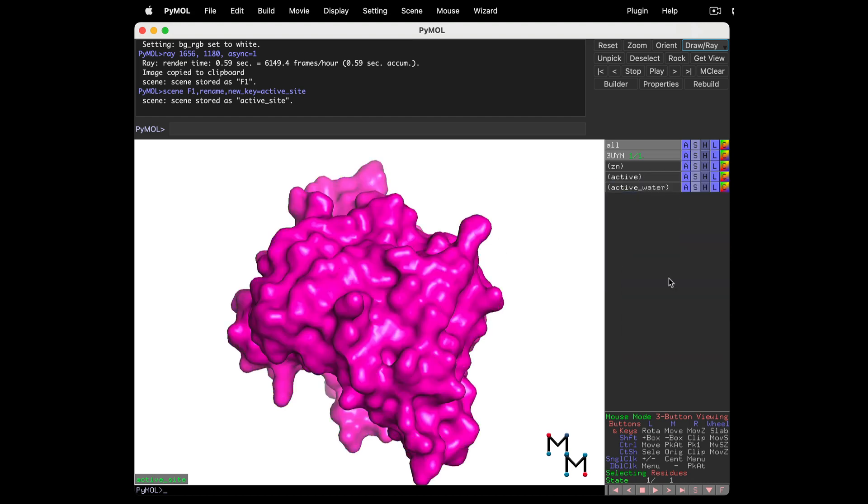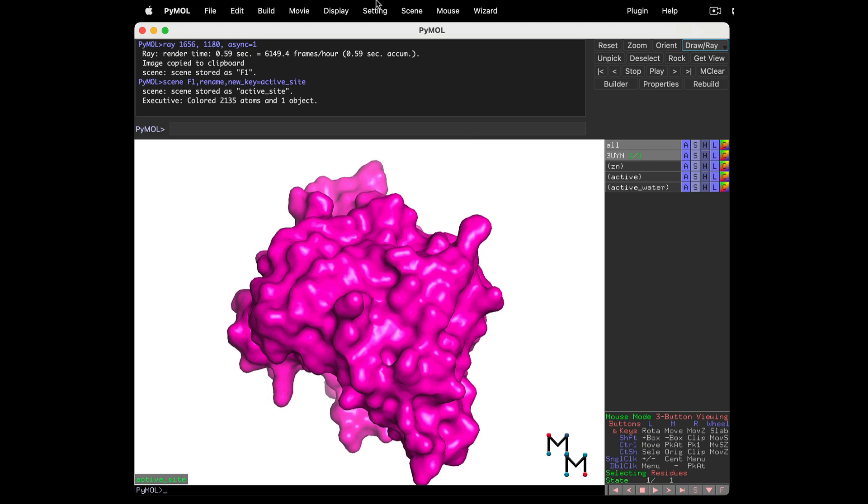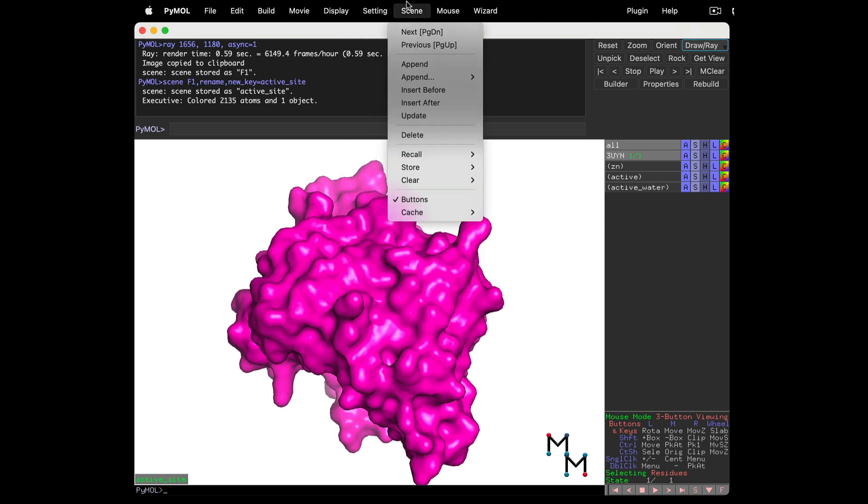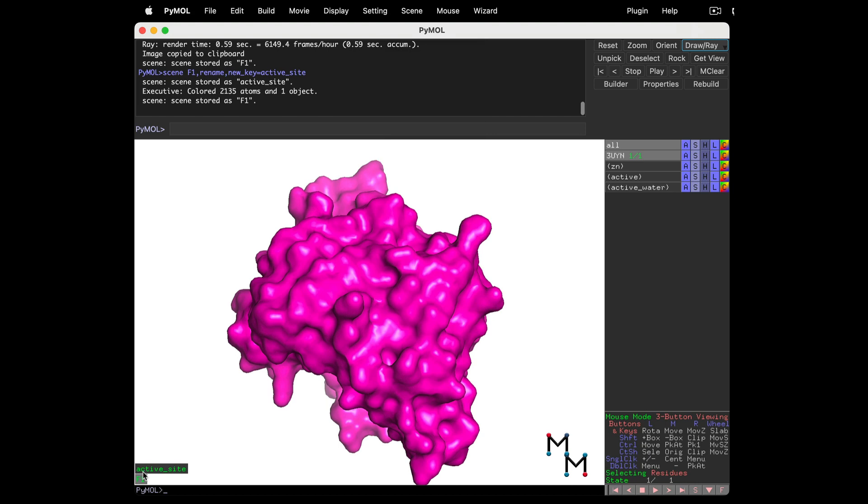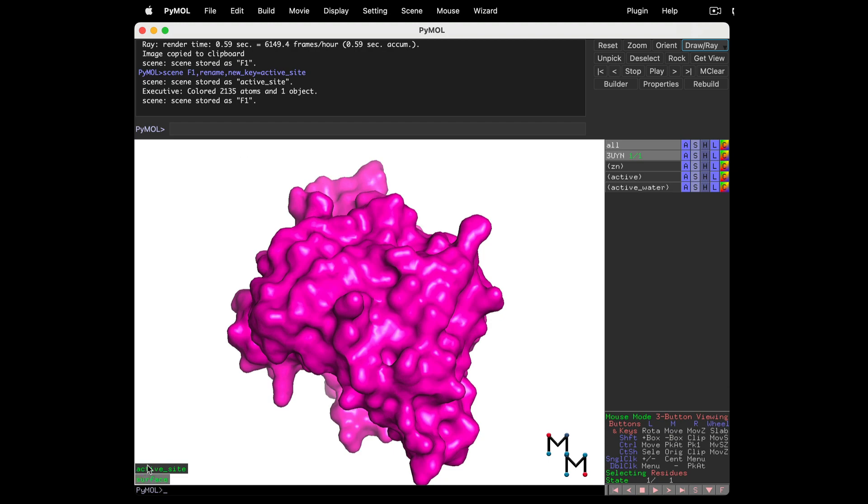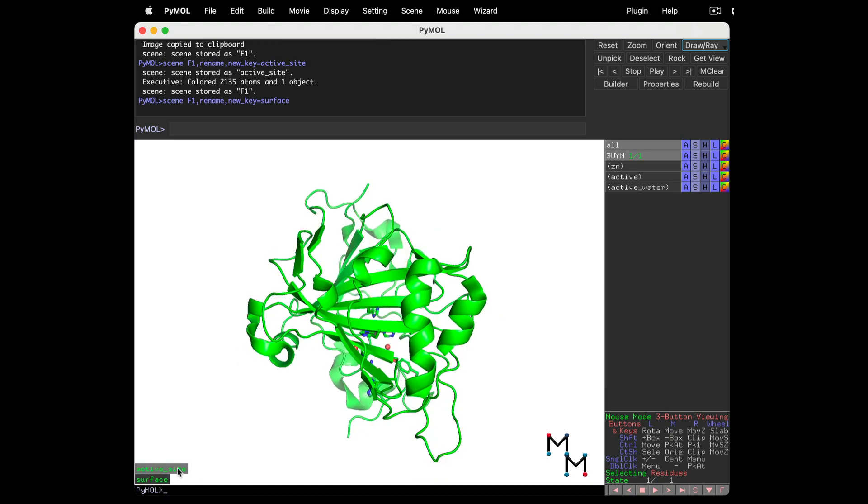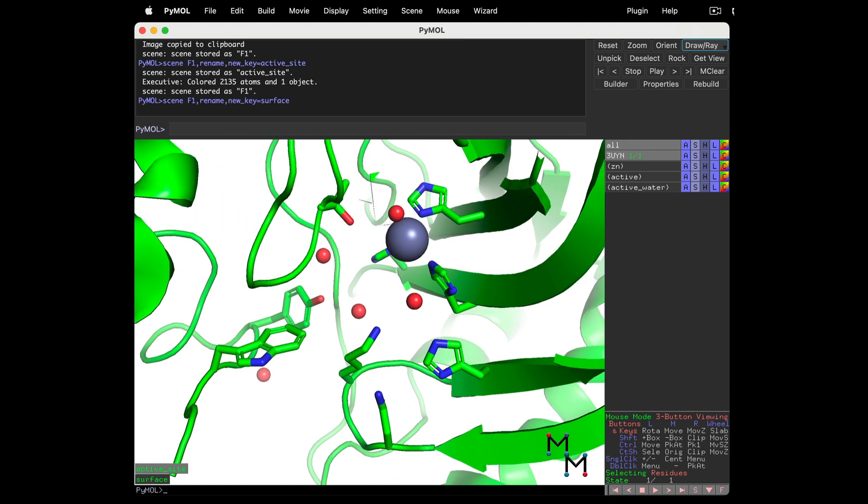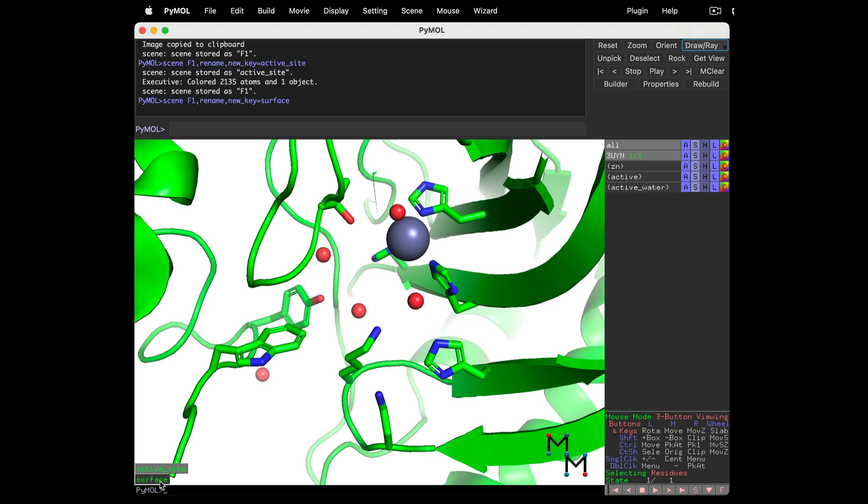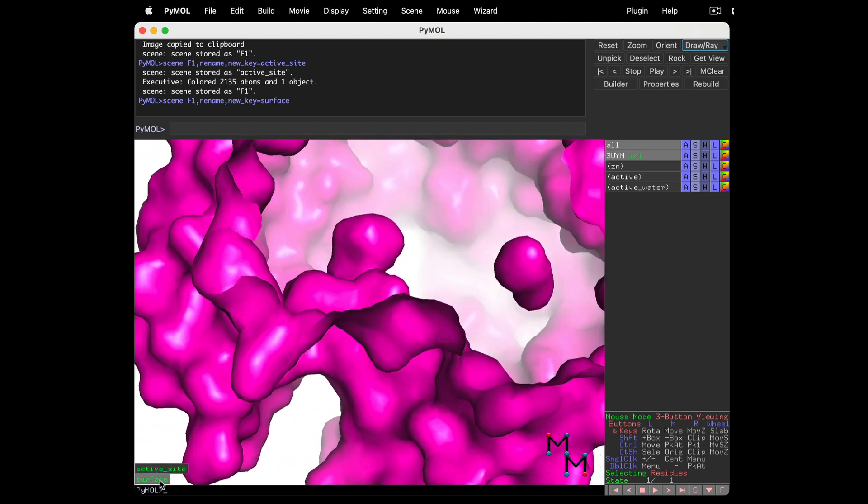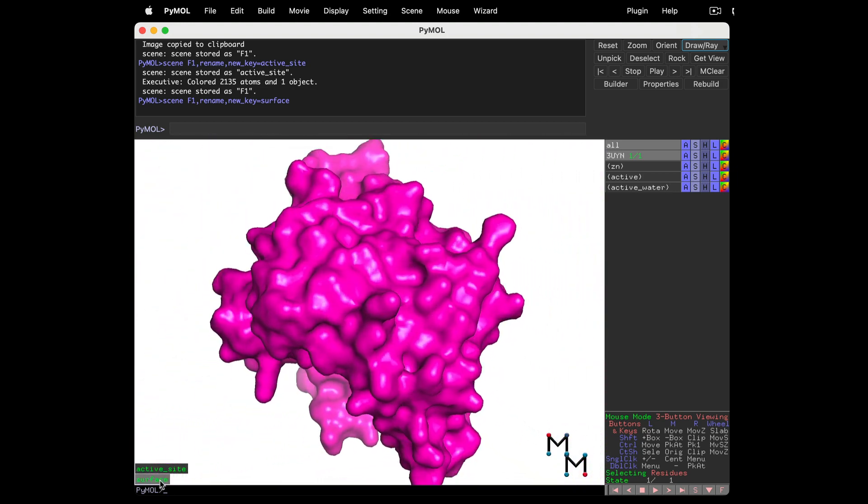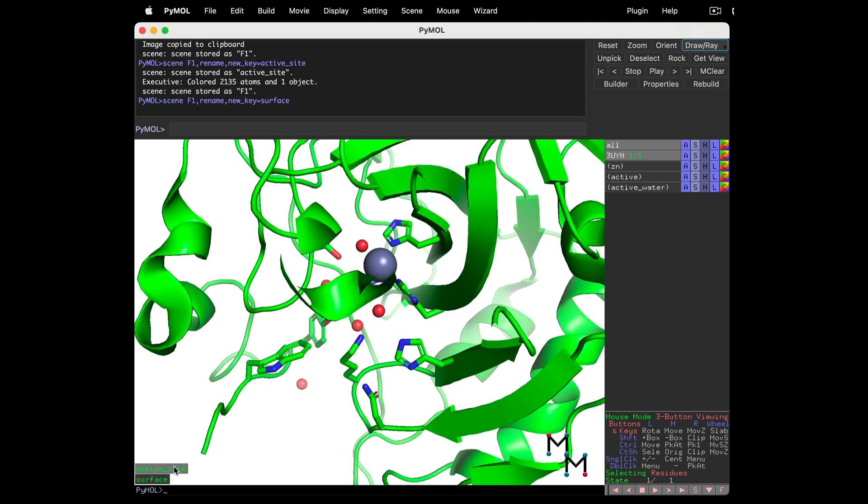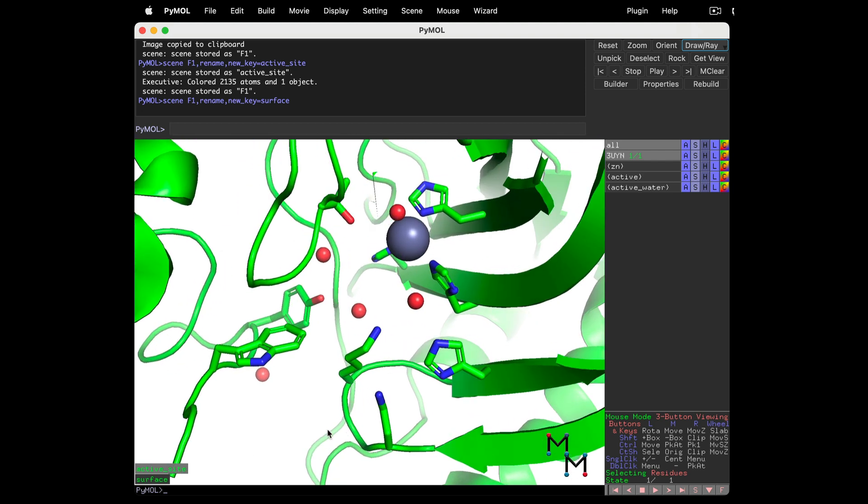Now save a scene. Scene drop-down, Store, F1. Right-click on F1 to rename it to Surface, or whatever you want. Now left-click on the two scene names to toggle between them. Neat! You can always return to the exact view from any scene you've saved.